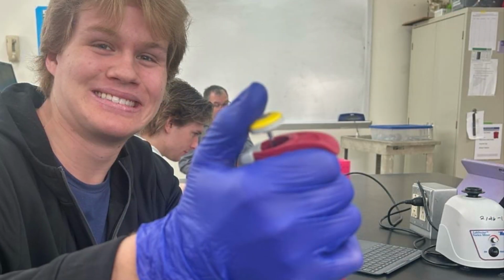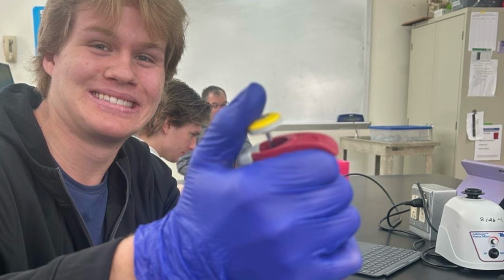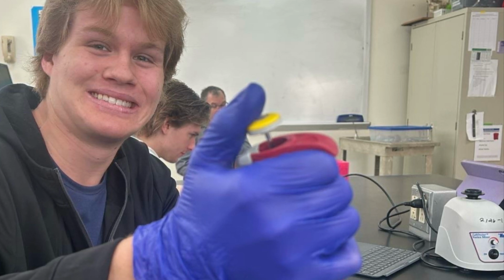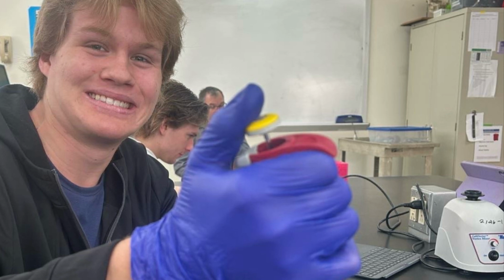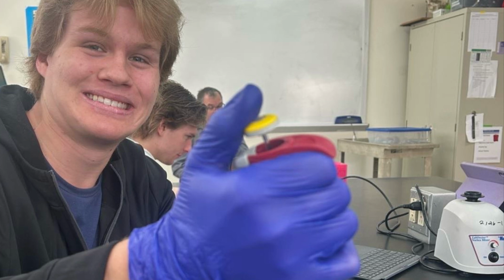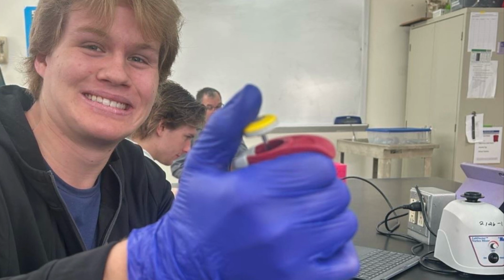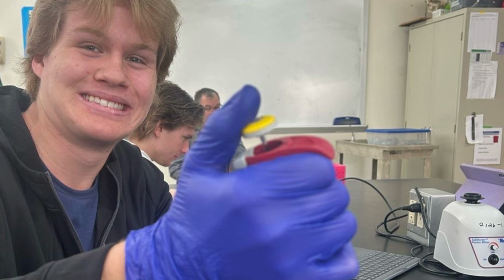In cultures grown in LB plus AMP, only resistant bacteria should survive and replicate. So we expect both the LB and LB plus ampicillin plates to show similar and high colony counts. And when plating bacteria from an LB-only culture, we predict more colonies on LB plates and fewer on LB plus ampicillin plates, due to the presence of both sensitive and resistant strains.